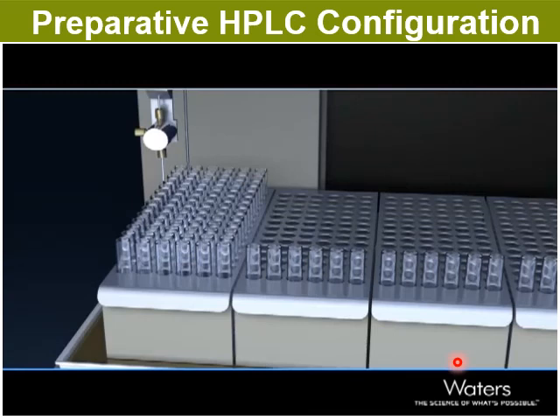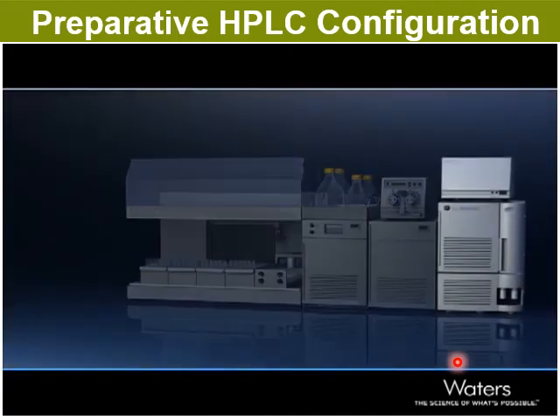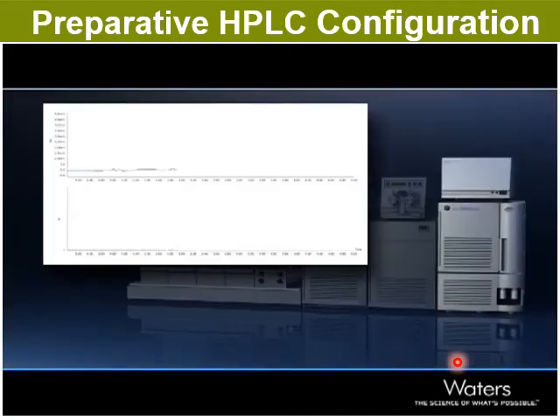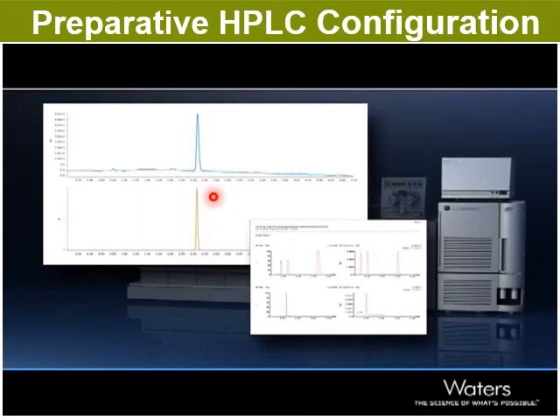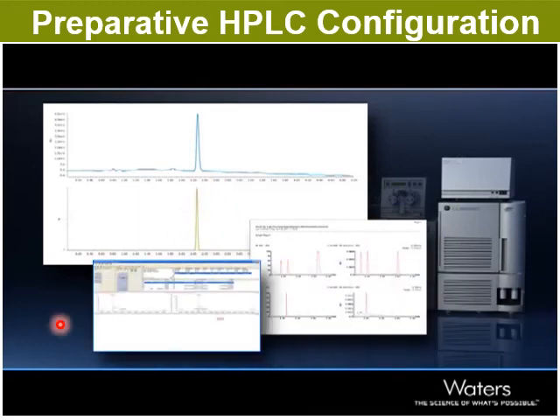Before fractions are removed from the collector, a small portion of the fraction can be tested analytically. This will provide the operator with an indication of its purity before further steps are taken. Automatically generated reports from each stage can be emailed or displayed depending on preferences.